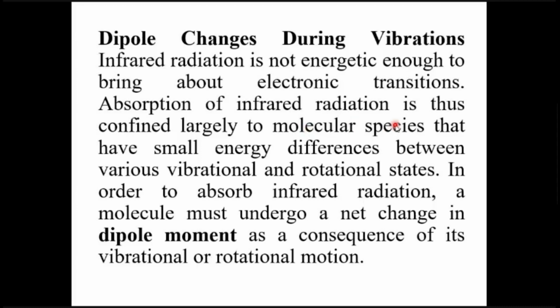Absorption of infrared radiation is thus confined largely to molecular species that have small energy differences between various vibrational and rotational states. So when infrared ray energy is absorbed by molecule, what is being changed within the molecule? Only they will either start vibrating more or they will start rotating more. So this is the way they are absorbing the energy.